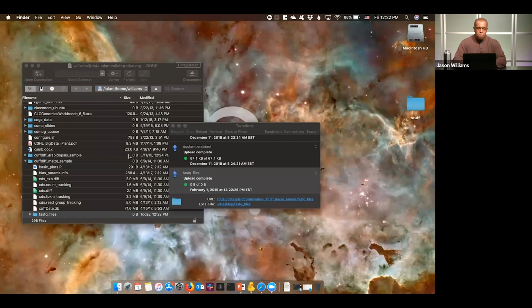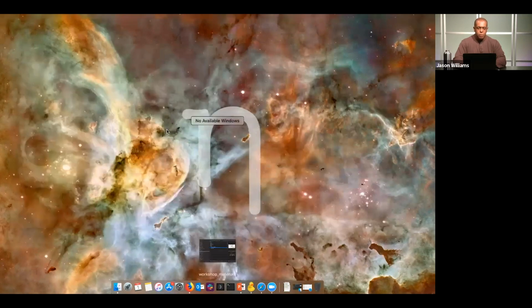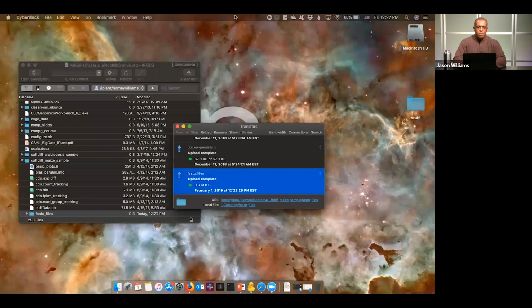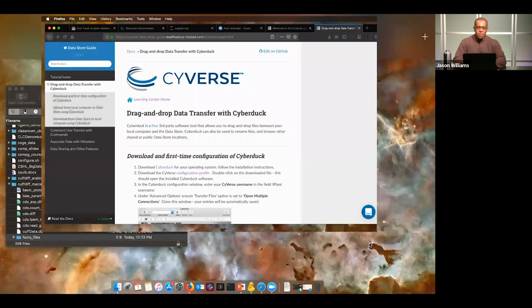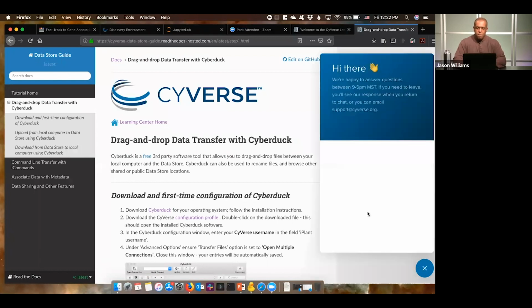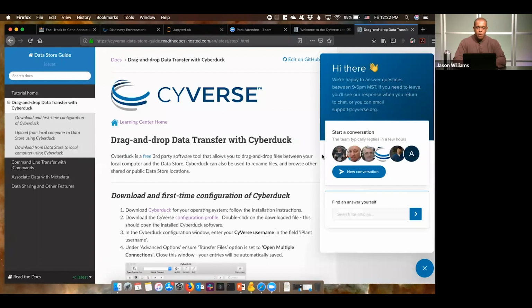You really shouldn't experience problems, but if you have questions about that or any of the documentation, let's take a look here. I'm still learning how to get all of my windows oriented. Keep in mind, in many places on CyVerse, including our documentation, there's this little help bubble, and you can go ahead and ask a question, and some CyVerse representative will assist you with any problem if you can't understand something or a link is broken.